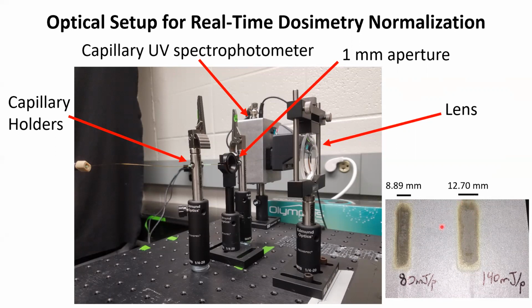Well, if our laser spot is changing size, then the illuminated area of the capillary is changing in width, which means that if we want to maintain our exclusion volume, we have to adjust our flow rate. That means that anytime you change the beam, you have to reprofile the beam cross-section and recalculate your flow rate. It becomes very easy to accidentally eat into your exclusion volume or change it, or even in some cases double illuminate part of your sample, which, if you listened to our introduction to FPOP video, you know is a big no-no in this experiment. It's a good way to get bad results.